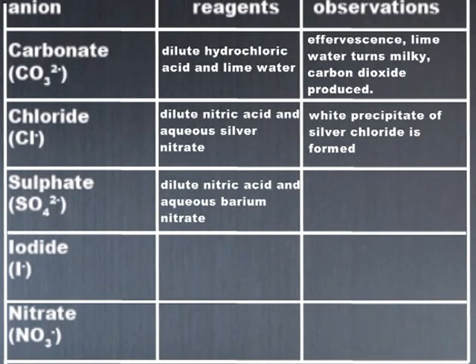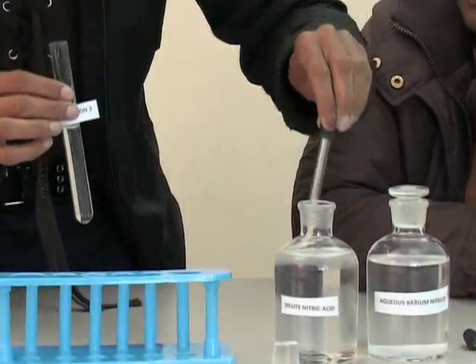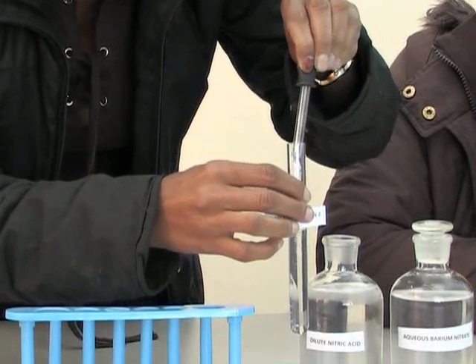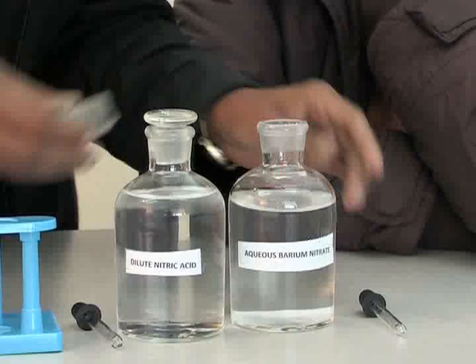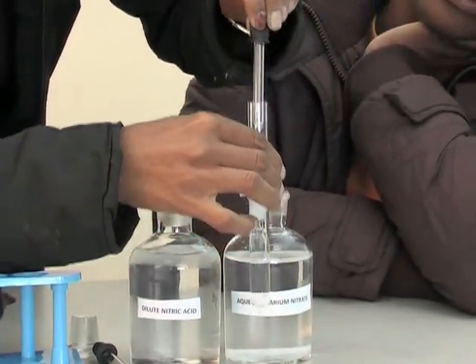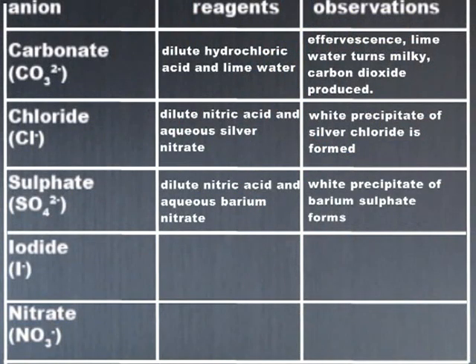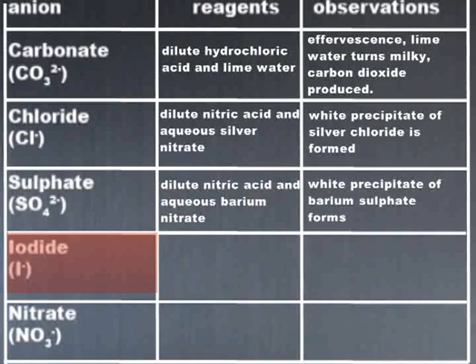Next to test is sulfate. To test for sulfate, we again need to add dilute nitric acid, but this time we add a few drops of aqueous barium nitrate. To the solution labeled unknown, we add a few drops of dilute nitric acid with the medicine dropper, and then we add aqueous barium nitrate with another medicine dropper. A white precipitate is formed again. This time it is the precipitate of barium sulfate, which proves that the unknown solution contains the sulfate ion.